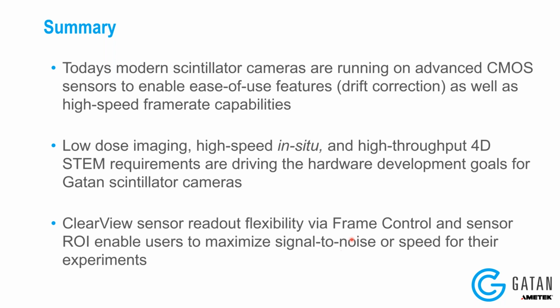And things like the frame control, how you can operate the camera and use the smaller sensor ROI areas with the camera to maximize the speed. All those things were also available on the ClearView and we're moving towards them for future cameras that we develop as well.